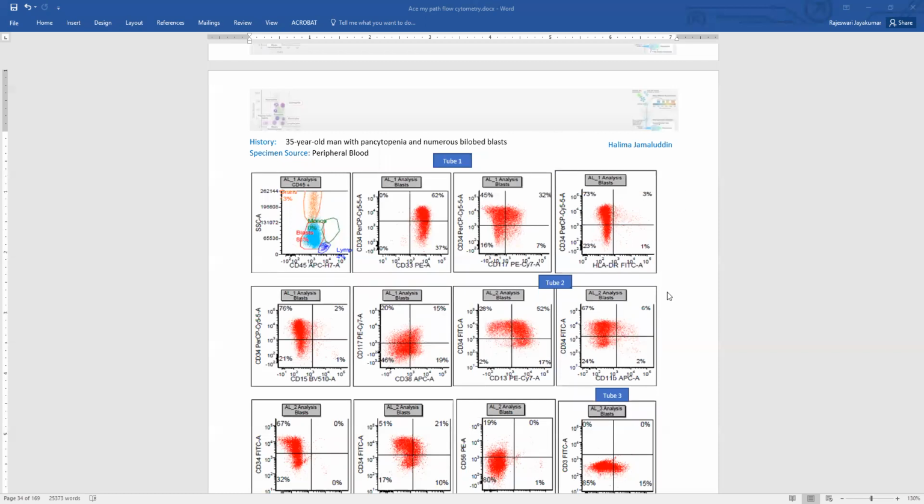So to summarize, microgranular variant will have slight deviation in phenotype from APLs. They can be positive for CD34, and they'll have some expression of CD2.